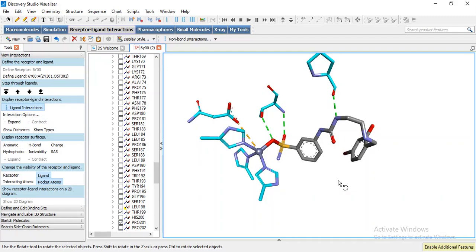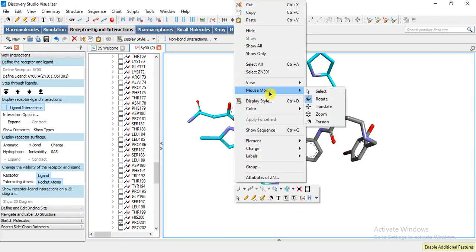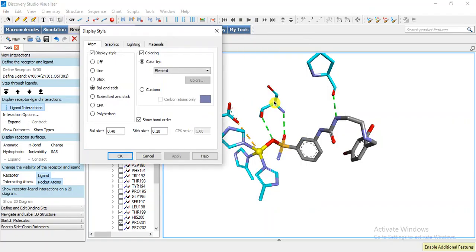Now we can select this zinc and we can change its display style ball and stick.